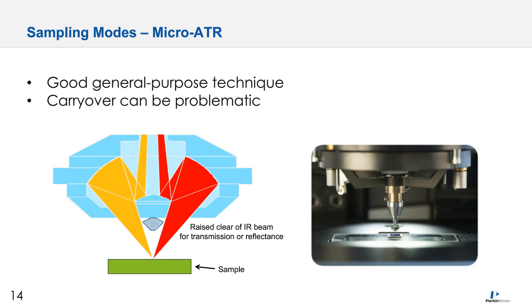So as an example, if you have a coating or paint which is on a polymer substrate, that polymer will not be highly reflective in the infrared range, and so performing a specular reflectance measurement with that material may prove to be challenging. The micro ATR measurement, because it's a surface technique, allows the user to actually probe that paint despite the poor reflectance of the polymer substrate beneath.